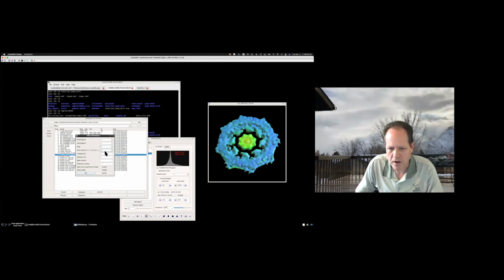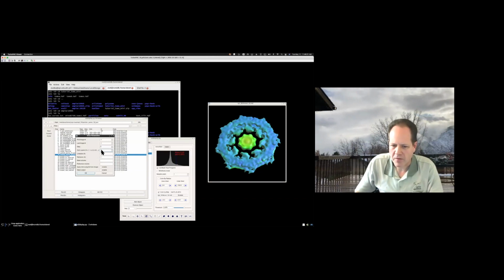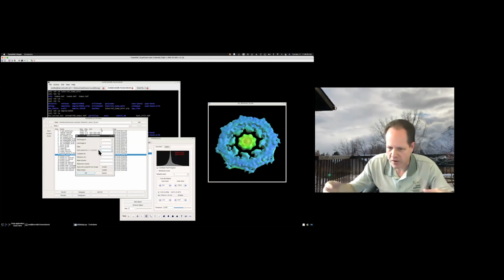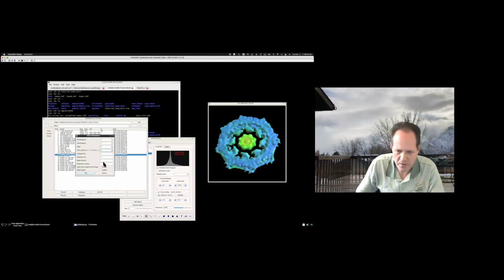And then I can pick a number of layers. If I set, oh, sorry, no, -1 uses the whole thing. If I use -1, it'll give me a full projection of the volume in each orthogonal orientation. So it'll give me an X projection, a Y projection, and a Z projection. If I set this to 0, then it'll give me a central slice. If I set it to 1, it'll give me a central slice plus or minus 1 slice on each side added together. So I'm basically making a restricted projection along all 3 axes, and this is very convenient.